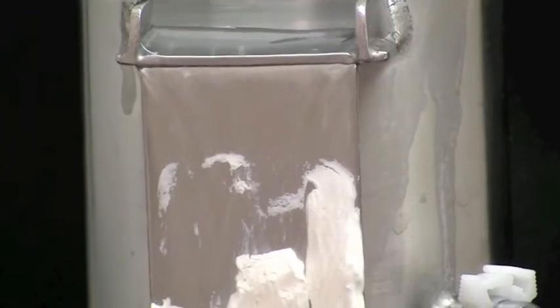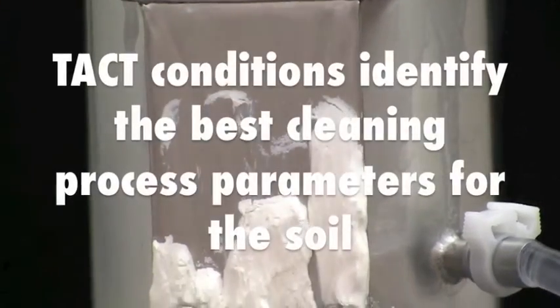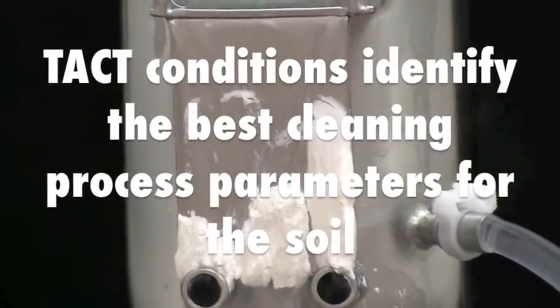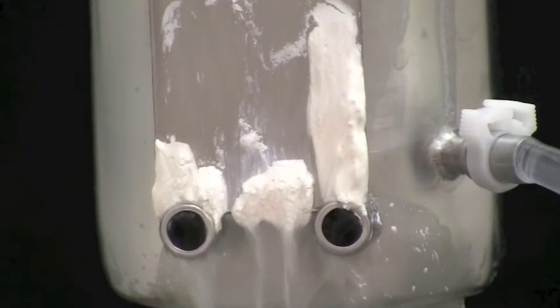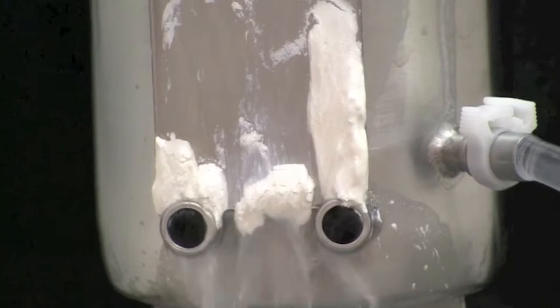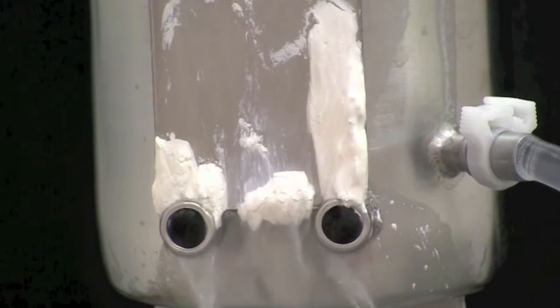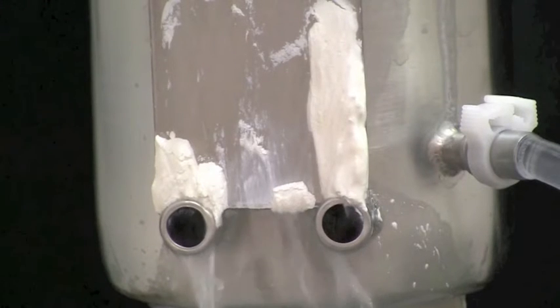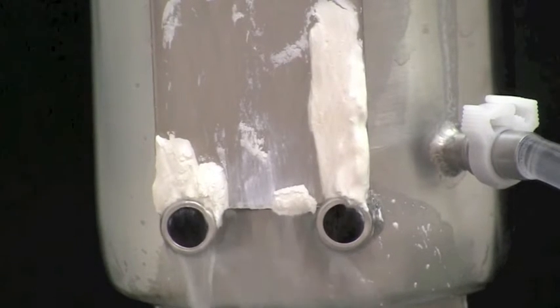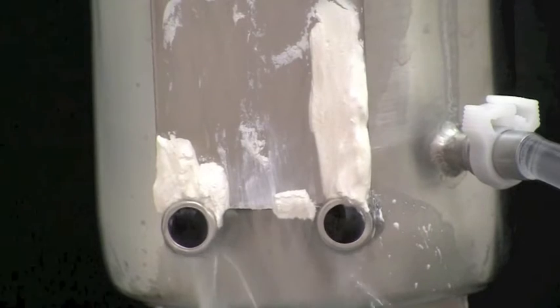During the Dober ACM process, we challenge the TACT conditions to identify the best cleaning process parameters for your soil. We often provide only mild action in order to emphasize the role of chemistry, concentration, and temperature, thereby ensuring that the increased action that your cleaning process provides at full scale will be highly effective at removing the soil.